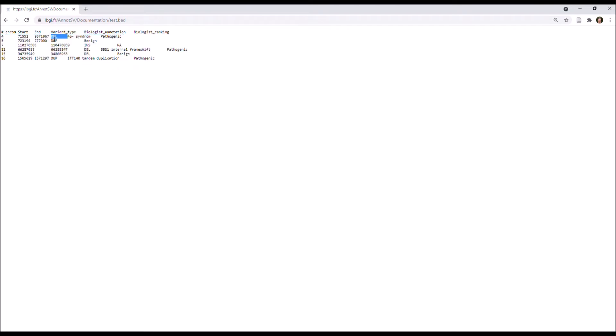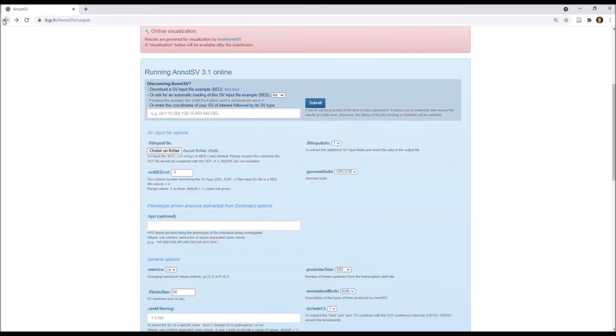deletion, duplication, insertion. And you also have additional information in this bed file with biological annotation and biological ranking. So now I get back to the submission page.